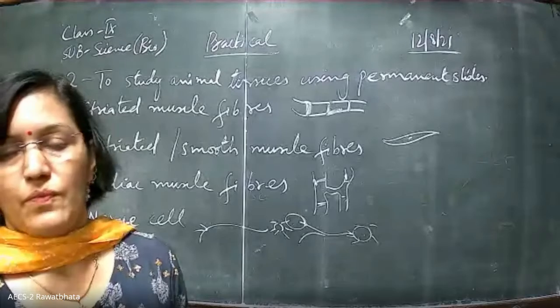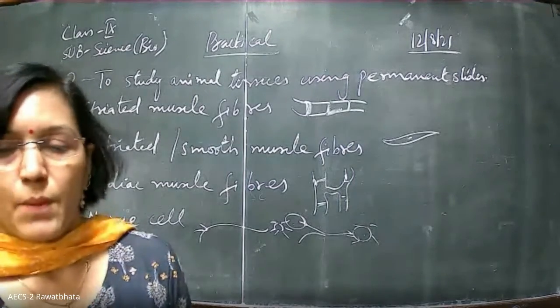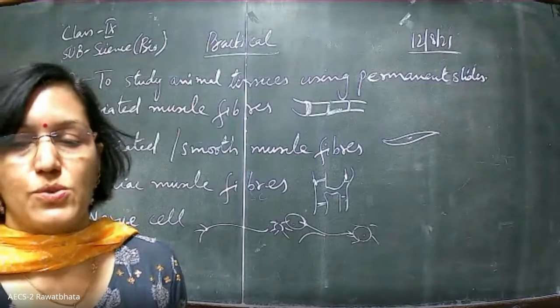This is how the nerve cell actually, the slide diagrams, of course, we have seen, but this is how a single nerve cell appears to us. A single nerve cell. This is the cyton with lots many dendrites around, one after the next, and there it follows the axon or the tail of it. And this cyton has one nucleus in the center. That means the cyton lies from here to here, where I'm keeping the cursor. And there continues the axon or the tail of it.